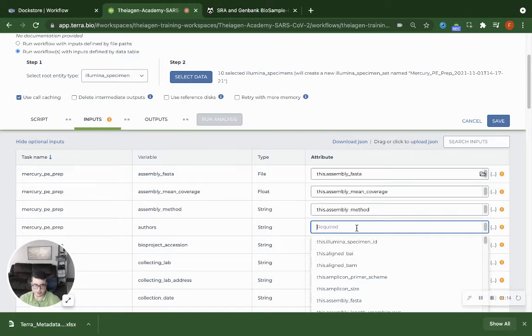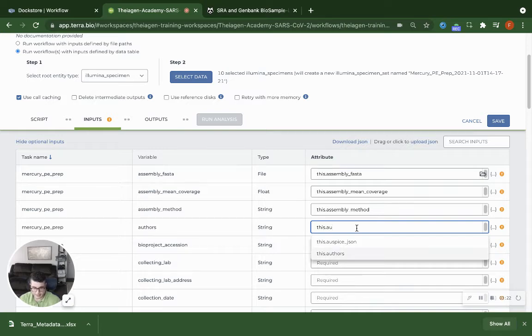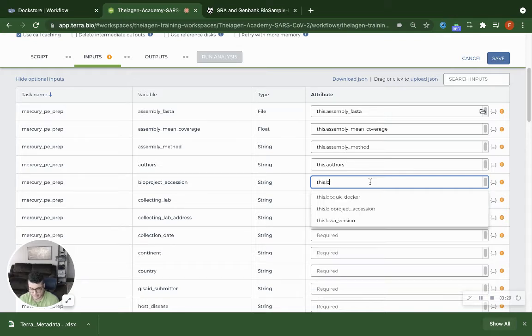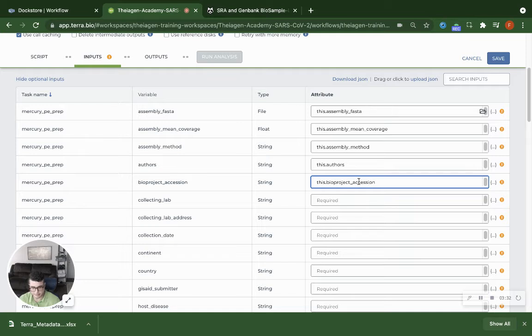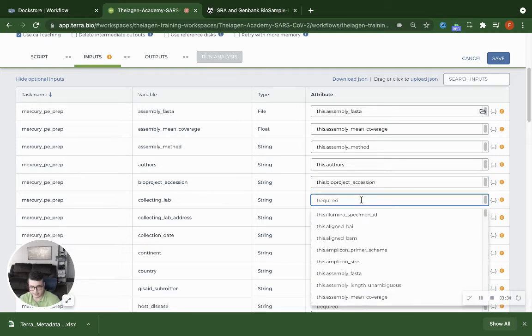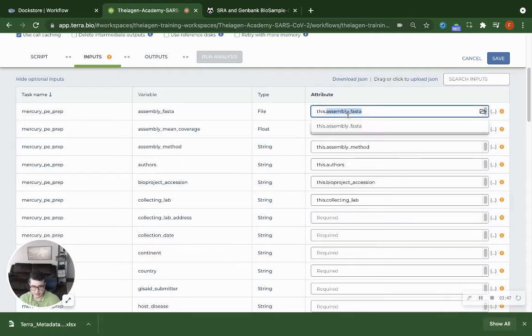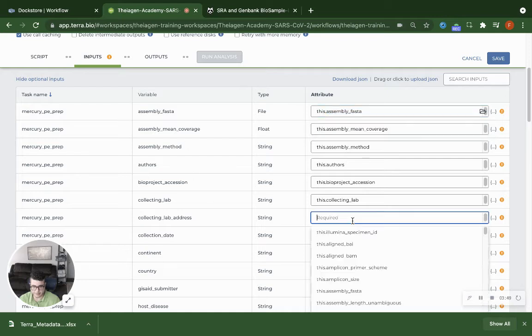So when using a Clear Labs instrument, you're provided both the assemblies and a FASTA file by Clear Labs. And many labs have found that it is beneficial to them to use the Clear Labs FASTA because the Clear Labs assembly process has some proprietary error correction regarding the boundaries of deletions. So in that case, you will be able to use the Clear Labs FASTA in this first input.